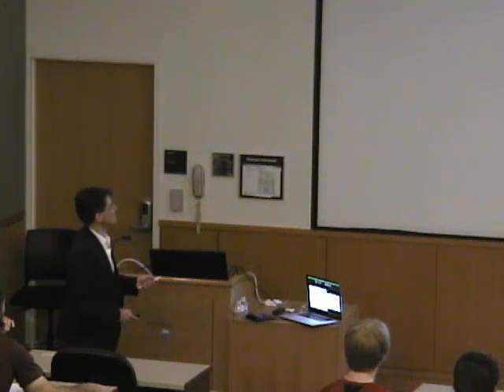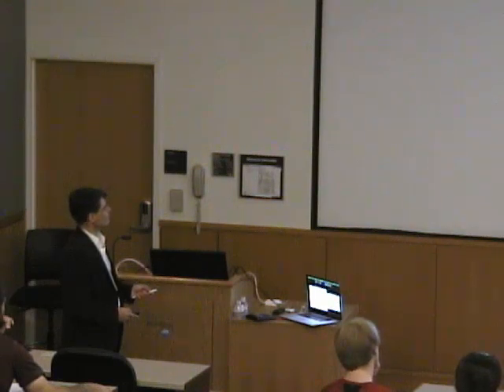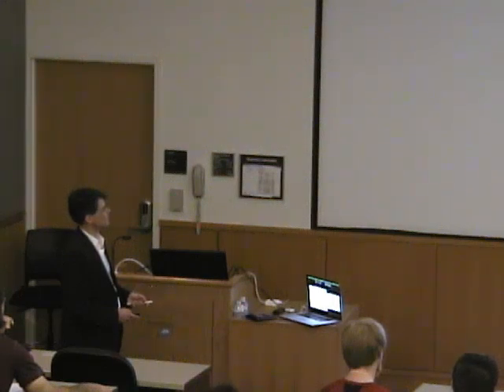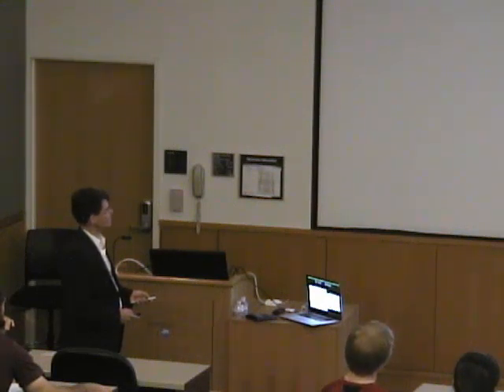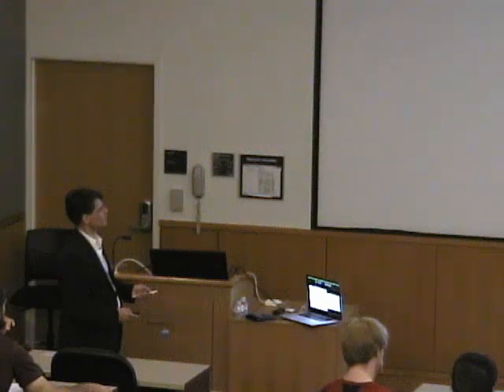Okay, so here is that model compound that I come back to a couple of times in the lecture. It's iron EDTA peroxide. You see it has a very rich MCD spectrum here in the ultraviolet, visible, and near-infrared region. And here's something funny happening. That is a spin 5/2 system. If I put the wavelengths to either here or here, I get really funny magnetization curves that go up and go down again. And for different temperatures, they don't overlay. And everything is pretty funny.